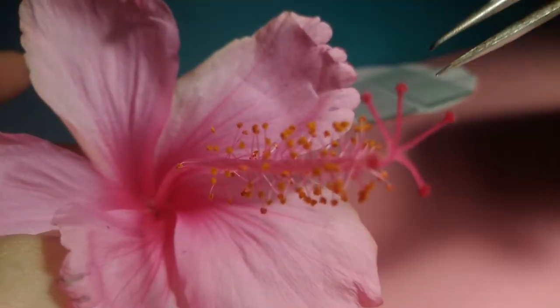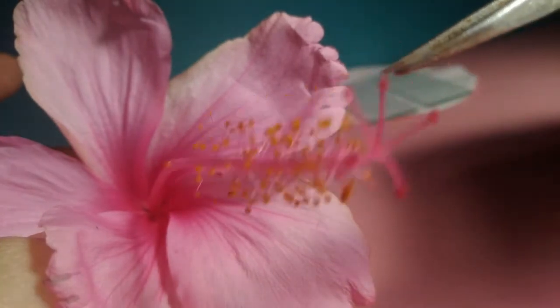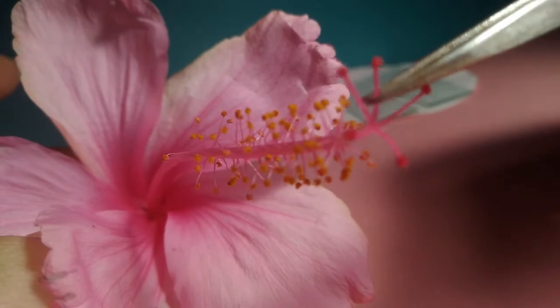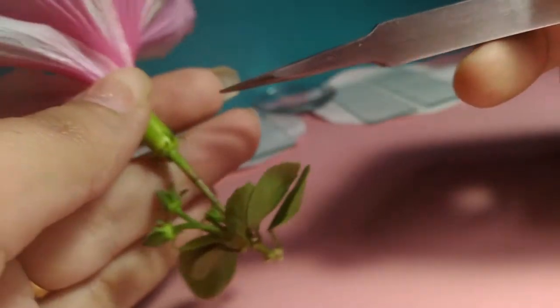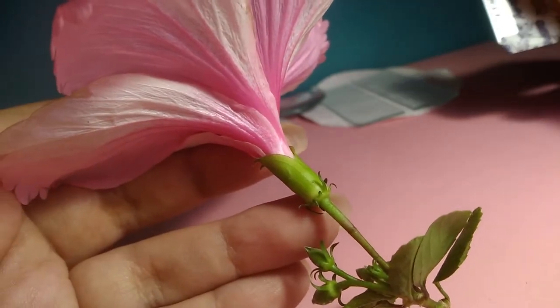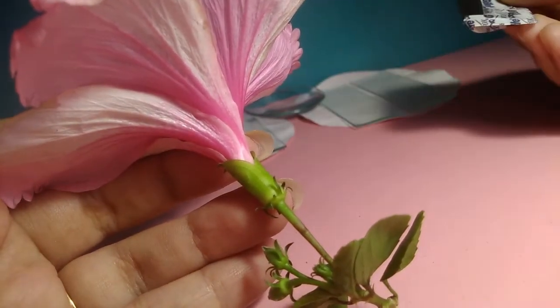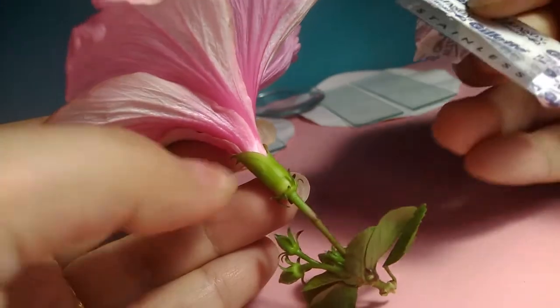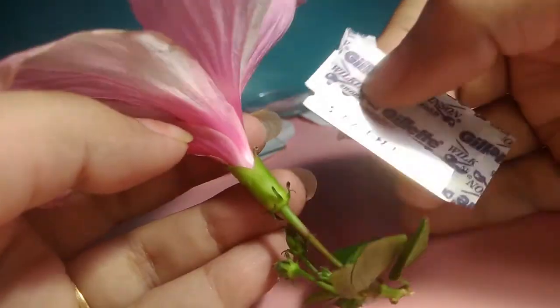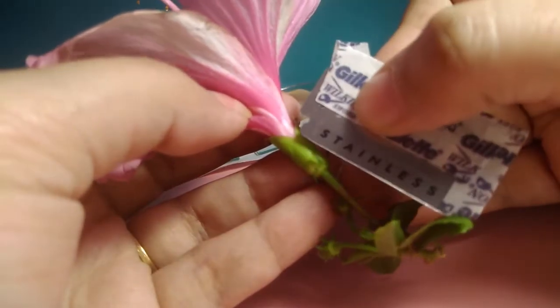And then we saw our innermost structure, which is the pistil. Now in the pistil we have this stigma and then the style, and below we have our ovary somewhere here. Now it is time to dissect the flower, for which I am going to use a blade here. You can use any blade, but be careful while handling the blade. So first we will cut open this calyx, which is the outermost whorl of the flower.